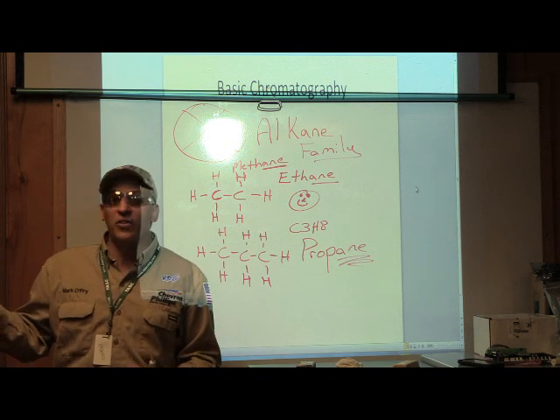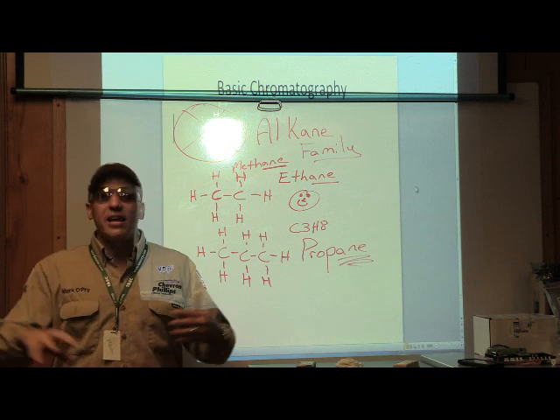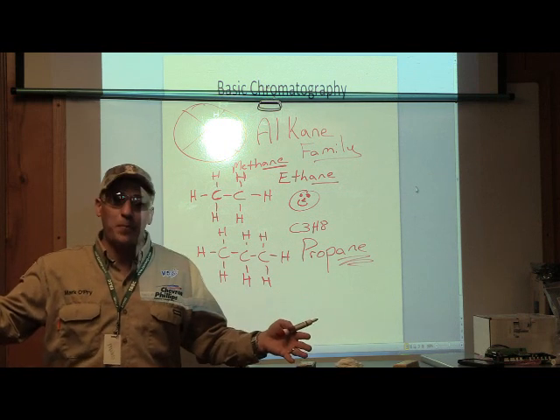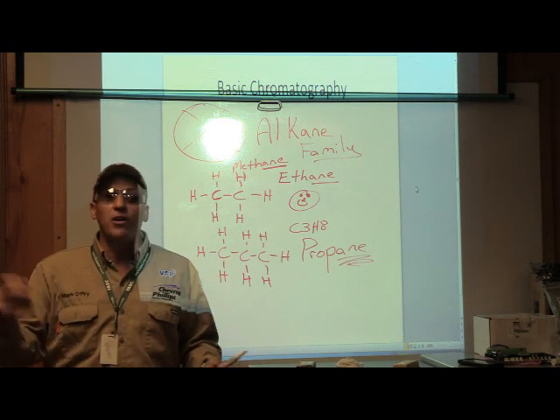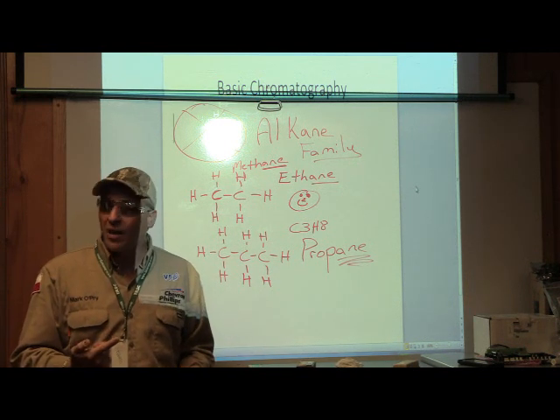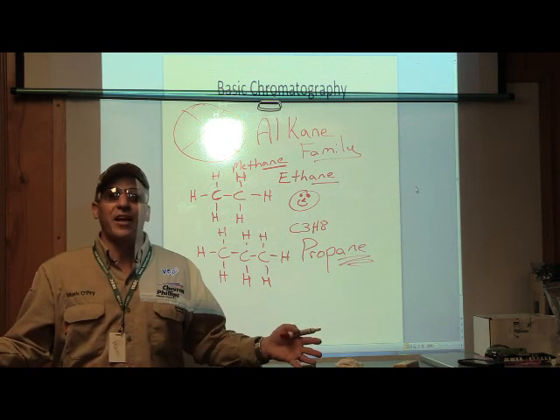And that's why we spend so much money on all of our sample bundles, heat trays, keeping everything super wicked hot, because otherwise the sample will condense back down into a liquid on you. You will not get a representative sample of your process. Your GC won't be seeing what it's needing to see, and everything goes to hell in a handbasket.